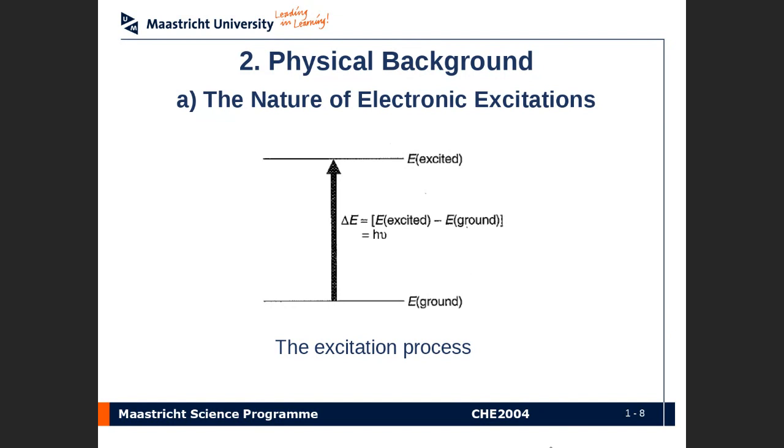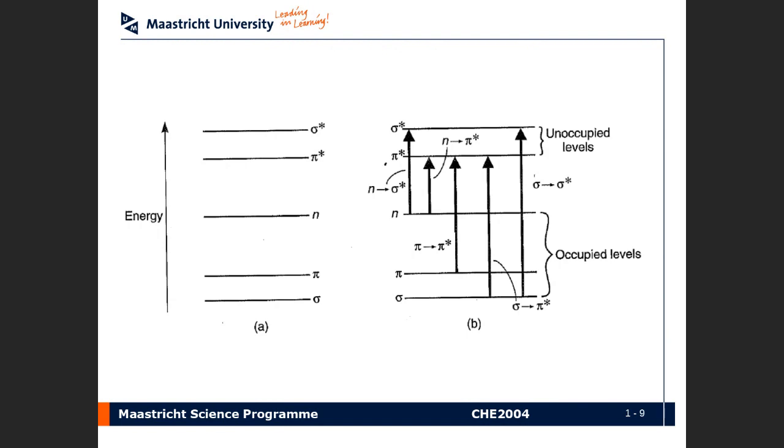Now, in the case of UV-Vis, right, we see on the left here, we've got different types of molecular orbitals, right? So you've got to think about this in terms of molecular orbital theory. And basically, if you look at molecular orbitals in a molecule, it's where the electrons are sitting from a molecular perspective. And of course, any molecule has these types of molecular orbitals.